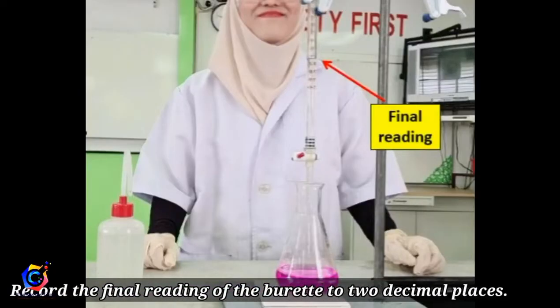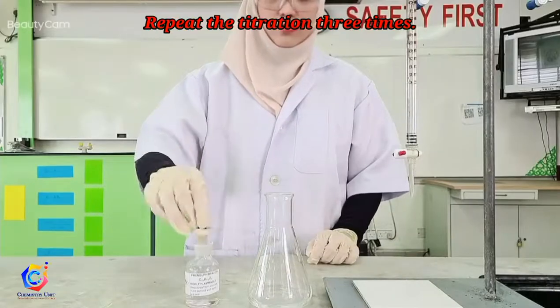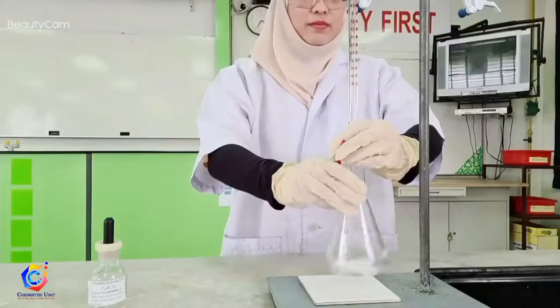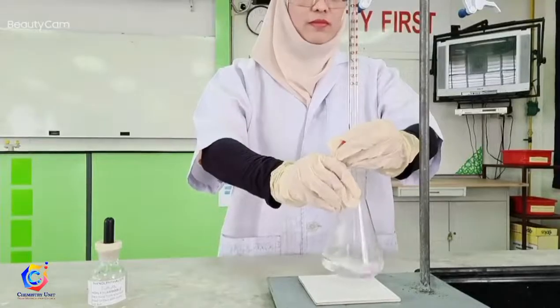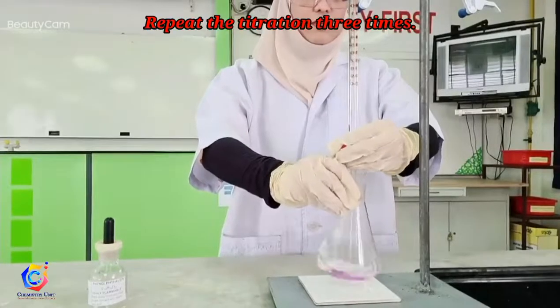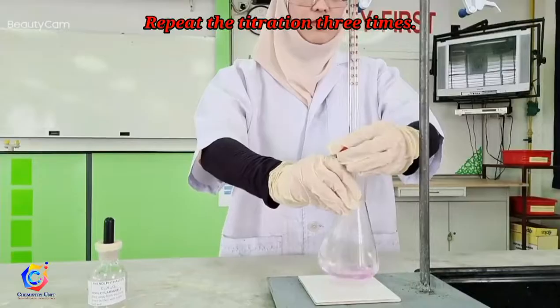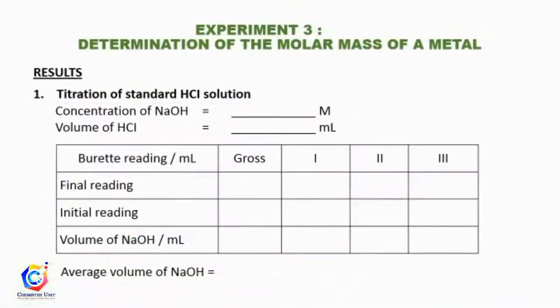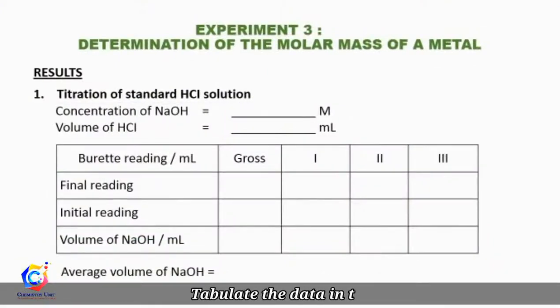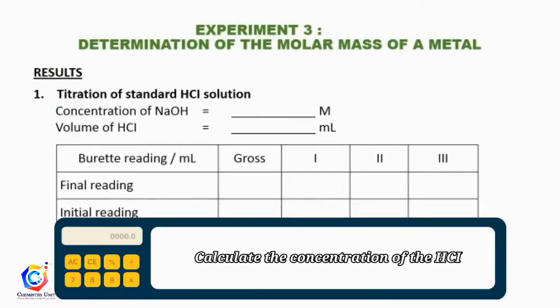Continue your titration until you get a permanent pale pink colour. Record the final reading of the burette. Now, for the actual three titrations, you need to repeat it three times, and the pink colour must be very light, unlike the one for the gross reading. When you have finished, tabulate the data in the data sheet and calculate the concentration of the HCl solution.